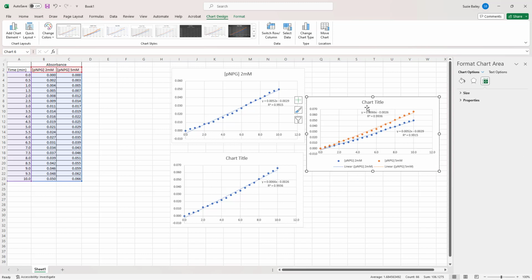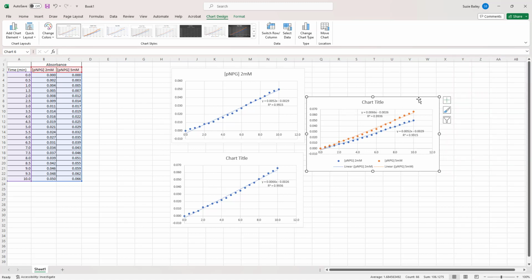And then we can clean this up and create a correctly formatted figure to summarize these results so that they're a bit more clean, a bit more interpretable by the reader. And so as described in the lab handout, the conventions for a correctly formatted graph are, of course, number one, to choose the correct graph type and plot the data correctly on that graph, which we've done. So, so far so good.